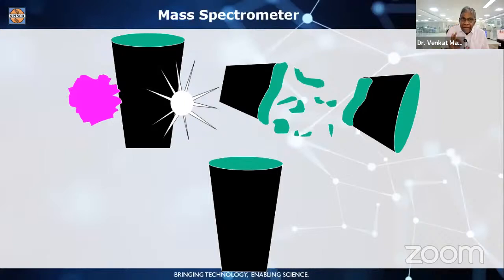If a beam of electrons bombards, the molecules are fragmented into ions. The fragmentation pattern that you get is the characteristic of your compound. As you get back the tumbler, you get back your molecule. That's what a mass spectrometer is. The beam of electrons is generated by the source. All the ions are analyzed by the analyzer. And then you get back your compound by recording it using an electron multiplier, a detector. All these happenings are inside the vacuum.